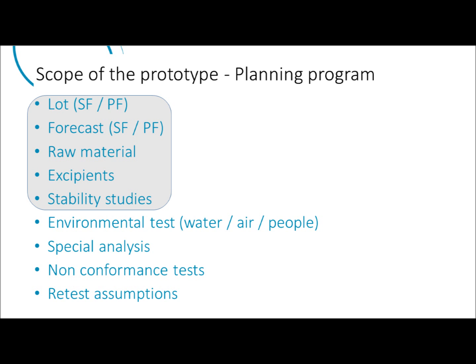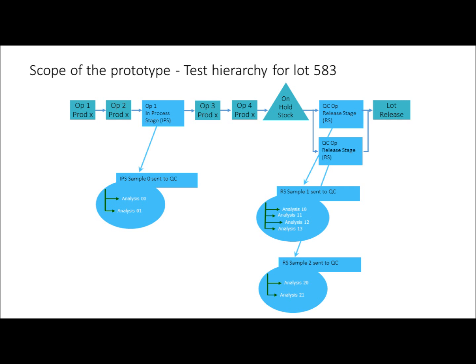More precisely, we will focus on 5 different tests: the lot test, the forecast test, the raw material tests, as well as your excipient test and your stability studies.